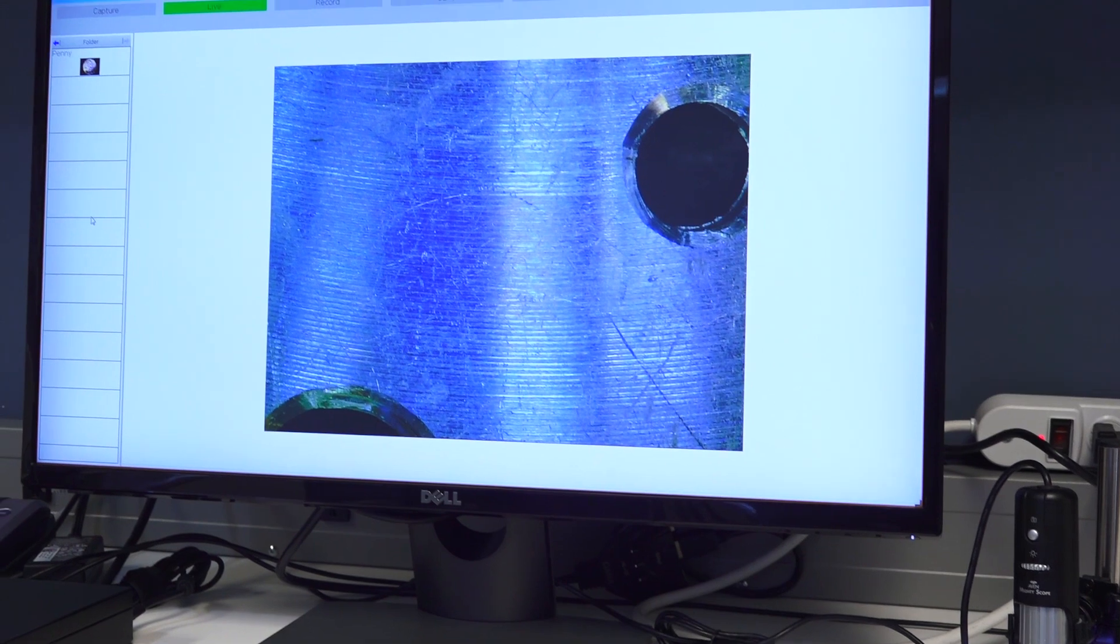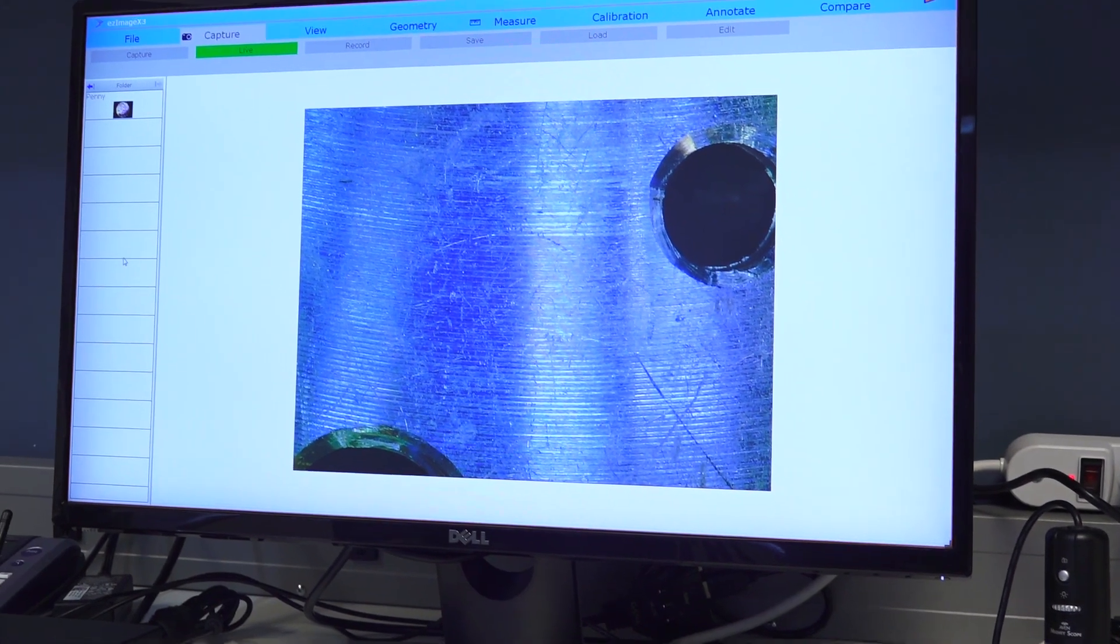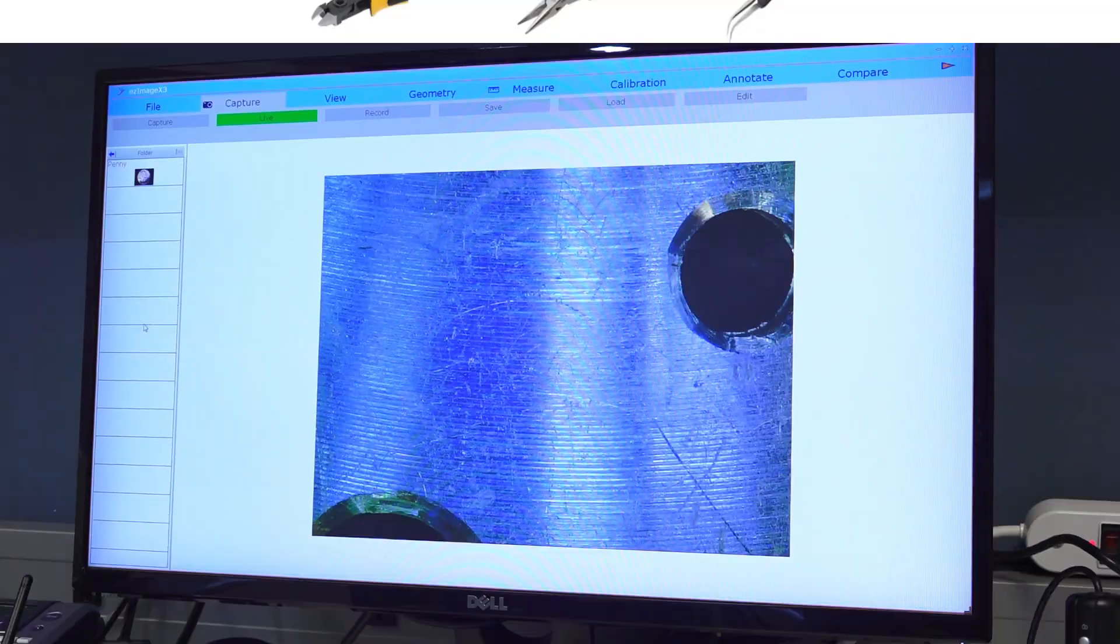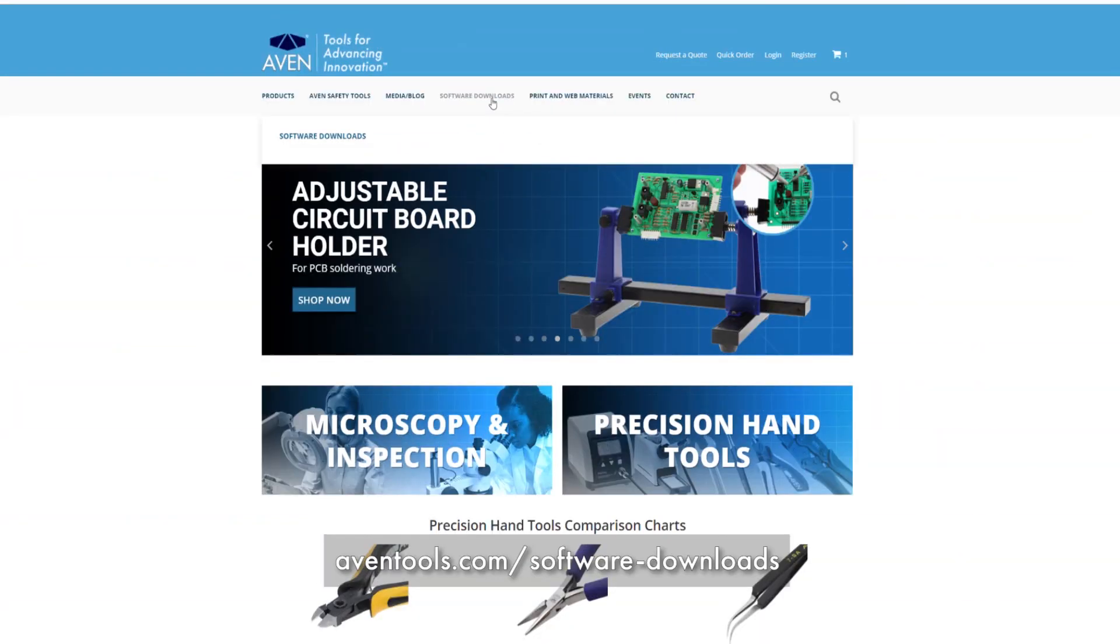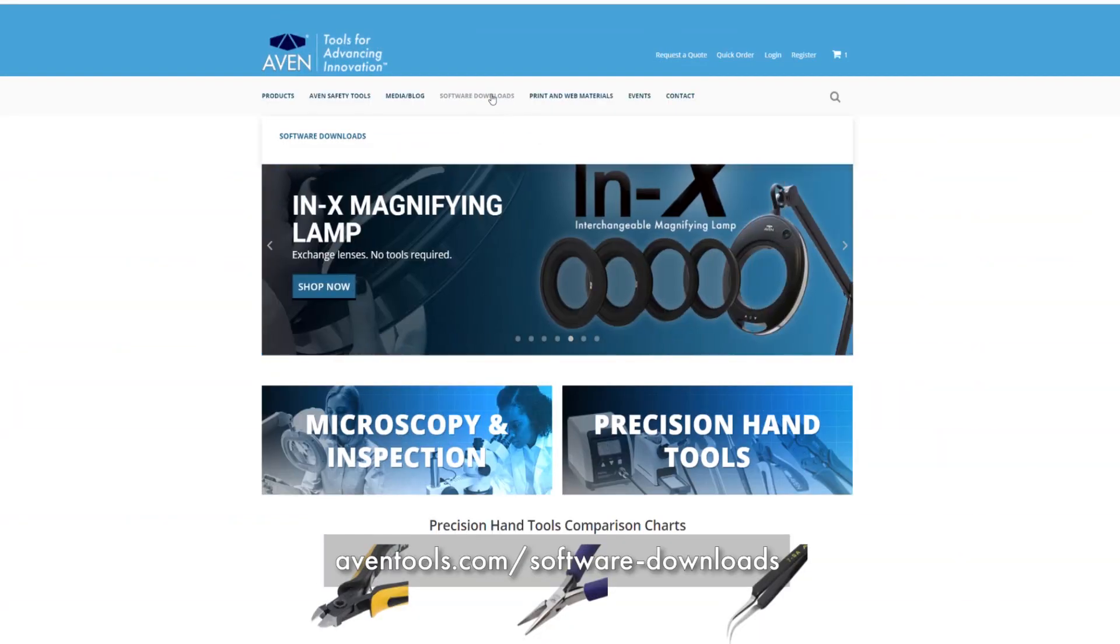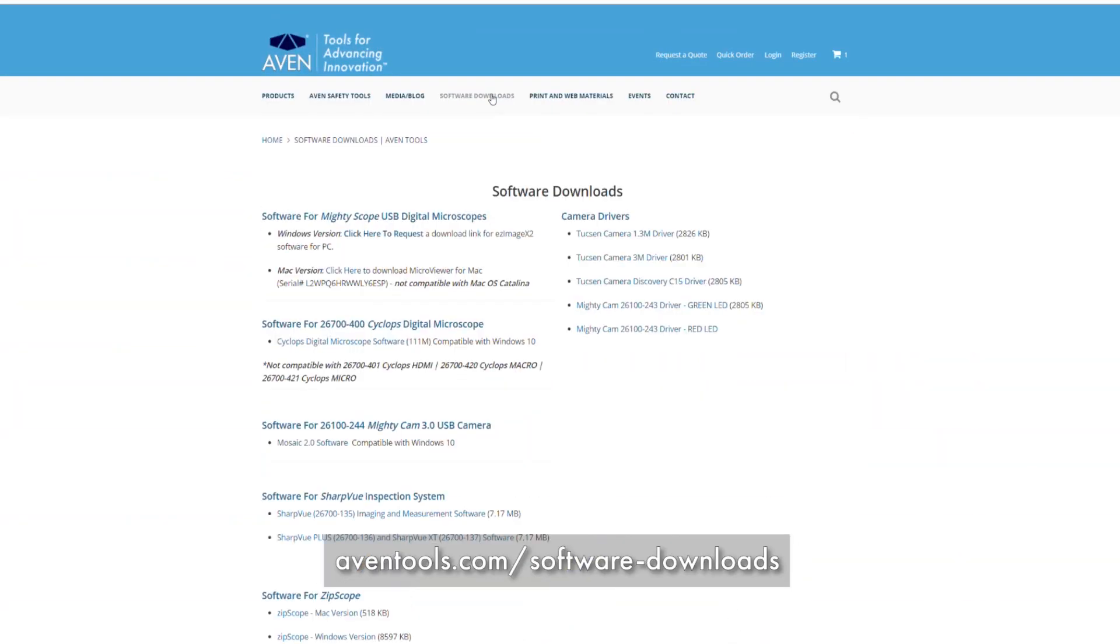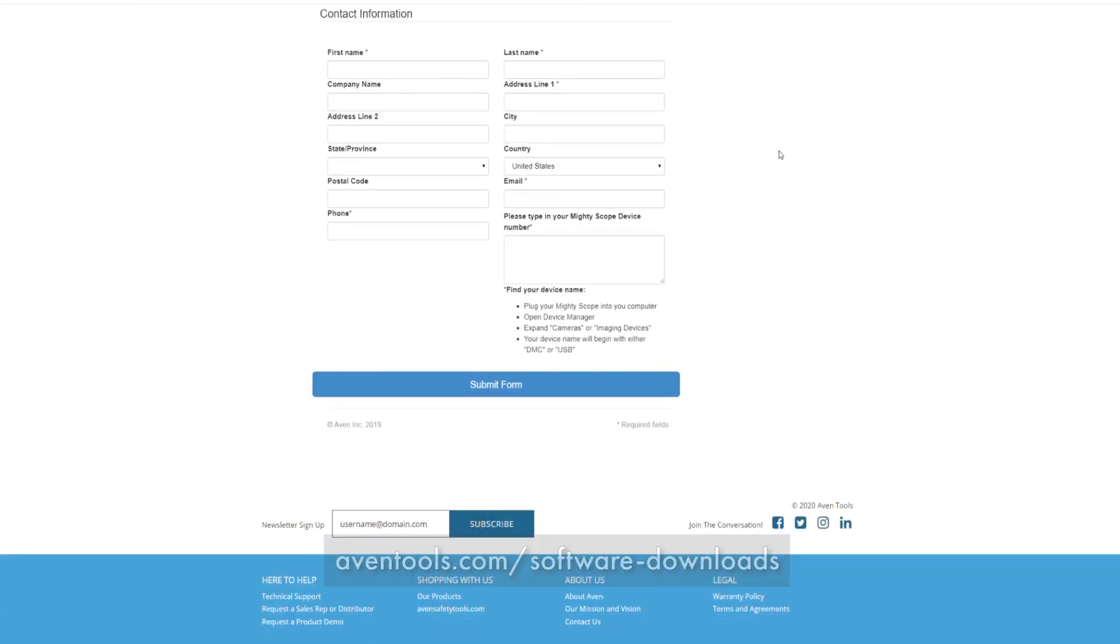Easy Image X3 is easy to set up and use. Simply go to aventools.com/software downloads, click on the link, fill out the form, and a download link will be sent to your email.